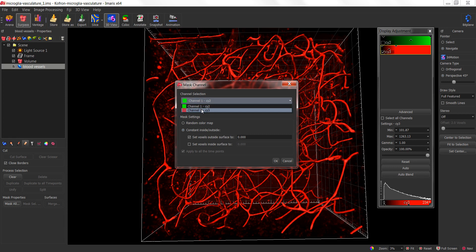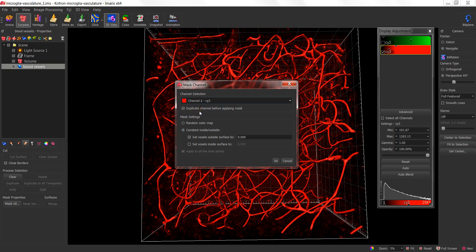We're going to do this with the Psi-3 channel. Also notice there is a checkbox that allows you to duplicate the channel before applying the mask, meaning you're not overwriting your original data. We are going to set the voxels outside of the surface to zero, meaning anything not inside the boundary of the surface will be turned to zero or black. You can also apply a voxel setting for the inside of your surface if needed. In this particular case, I want to improve the signal-to-noise, so I'm just going to turn off the background.